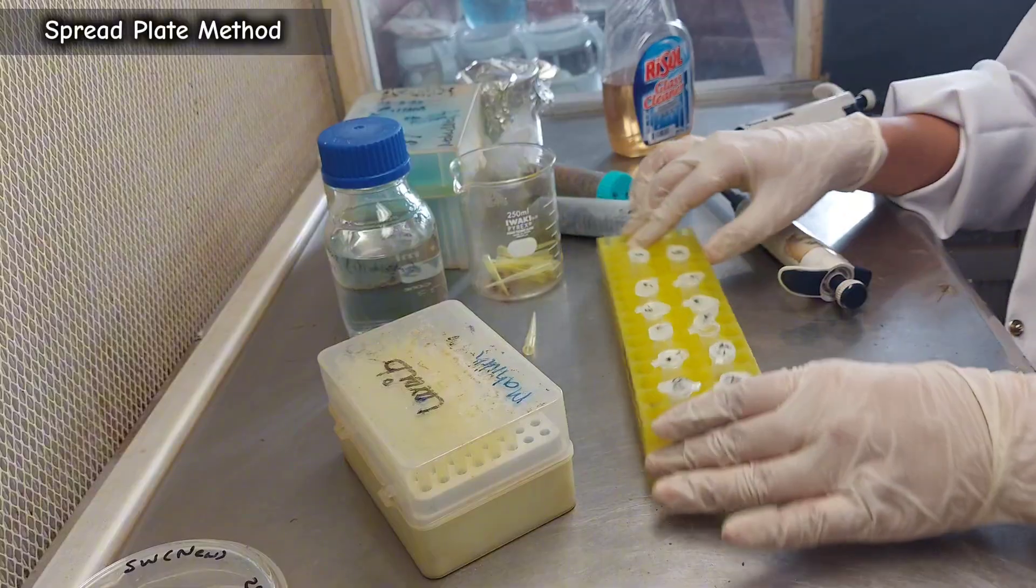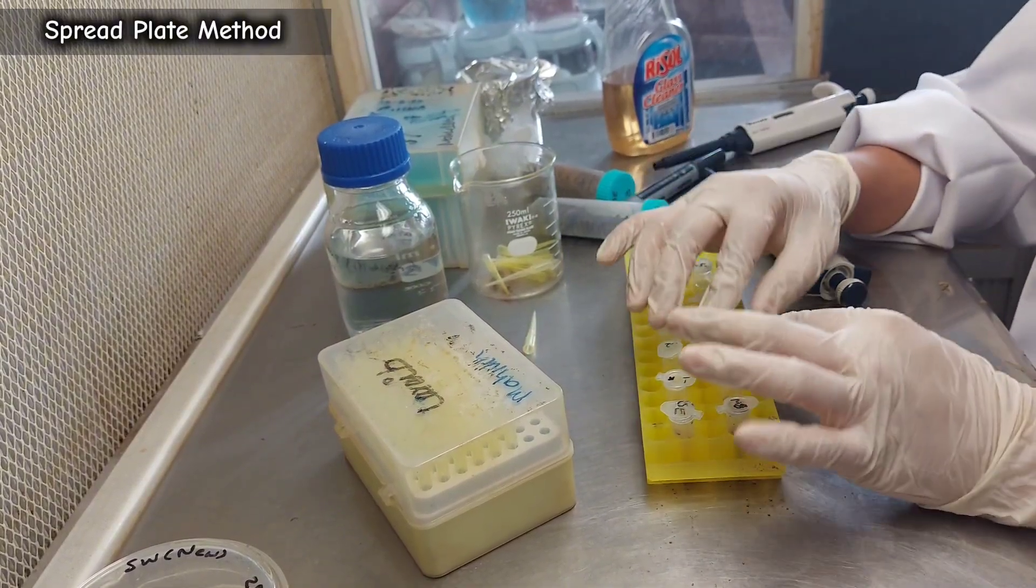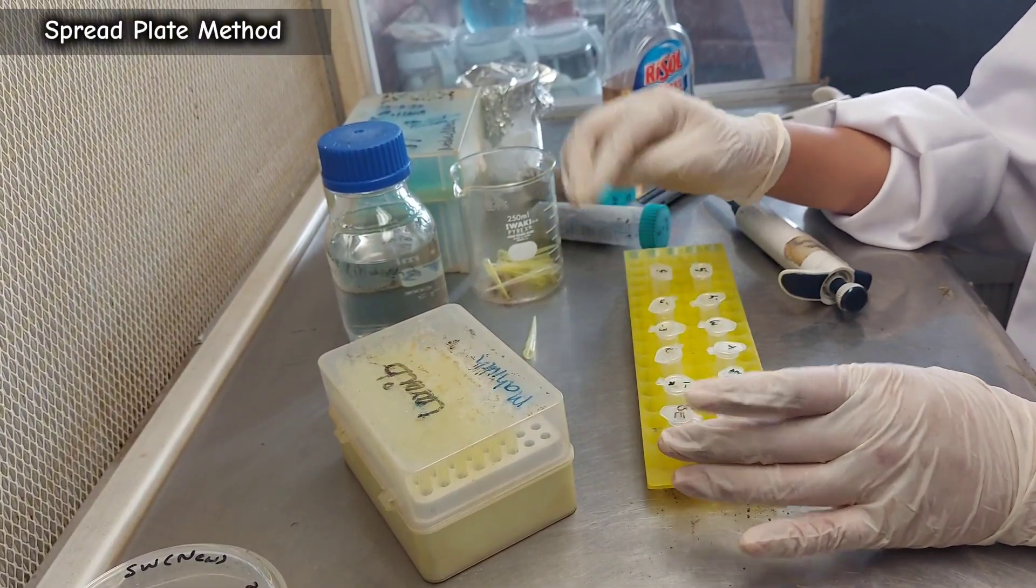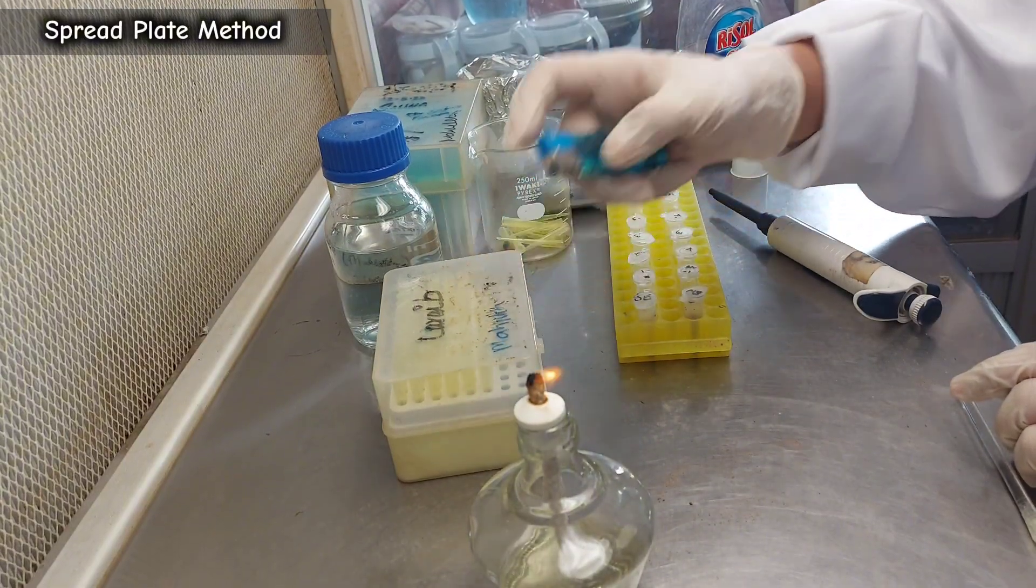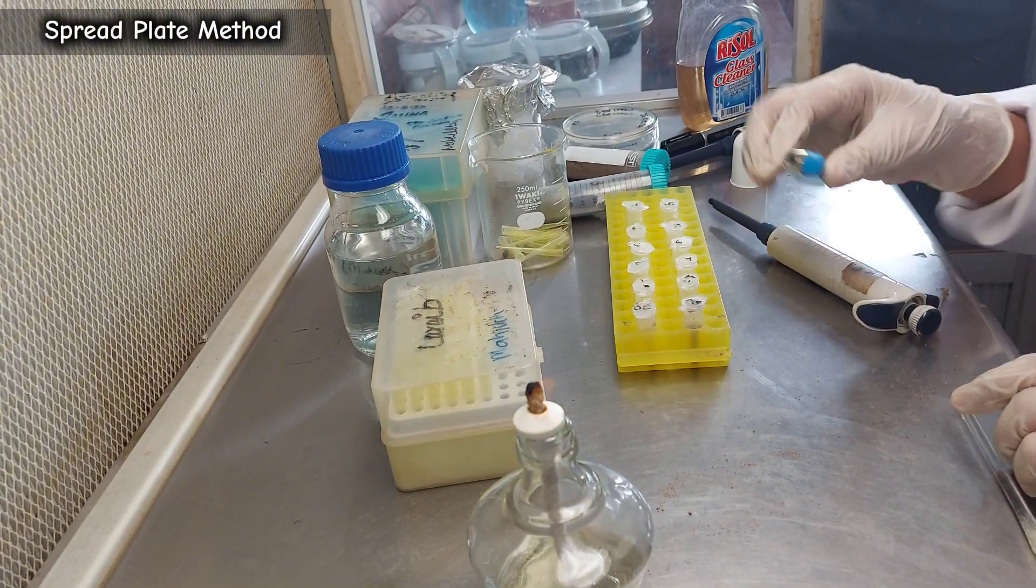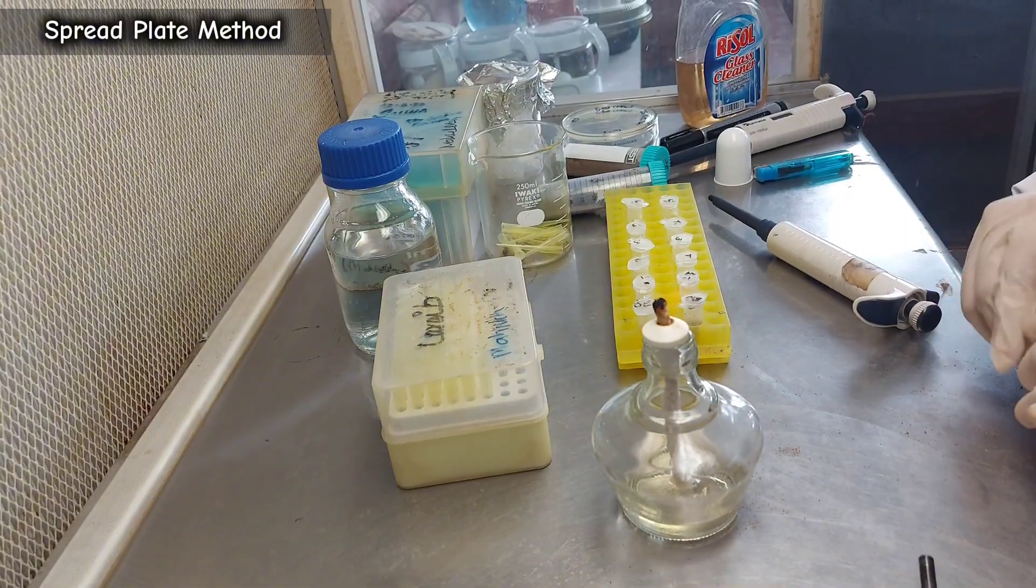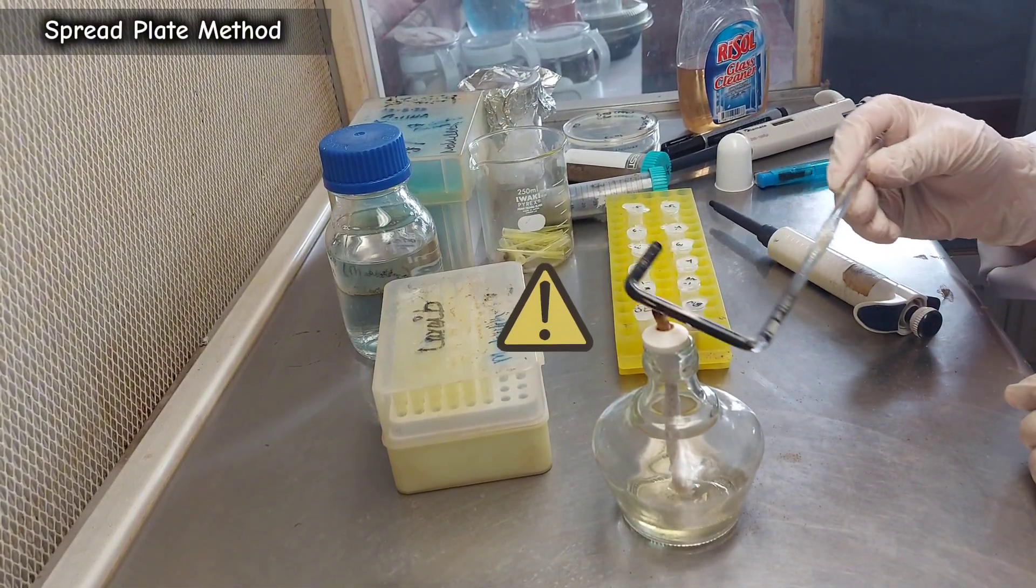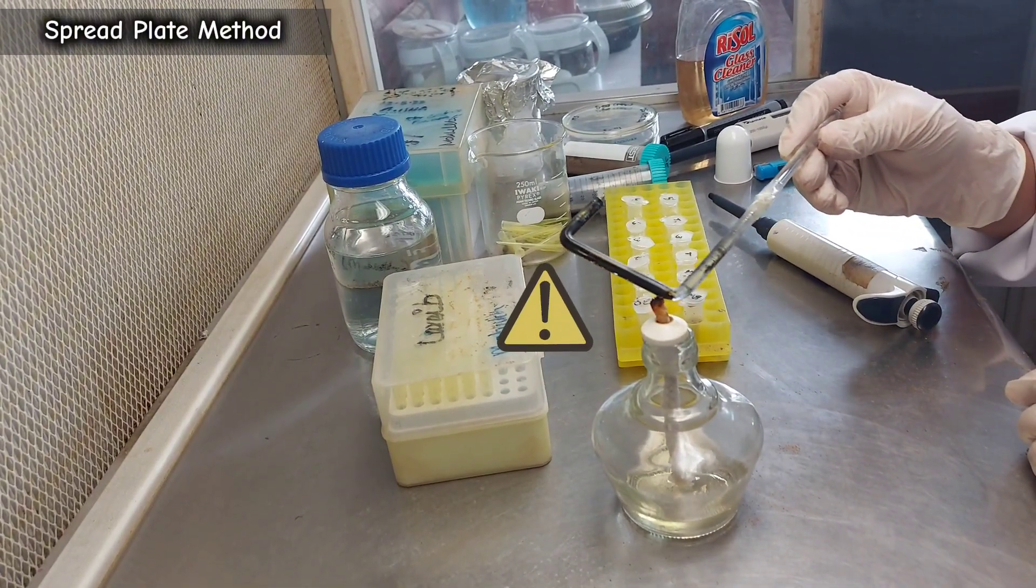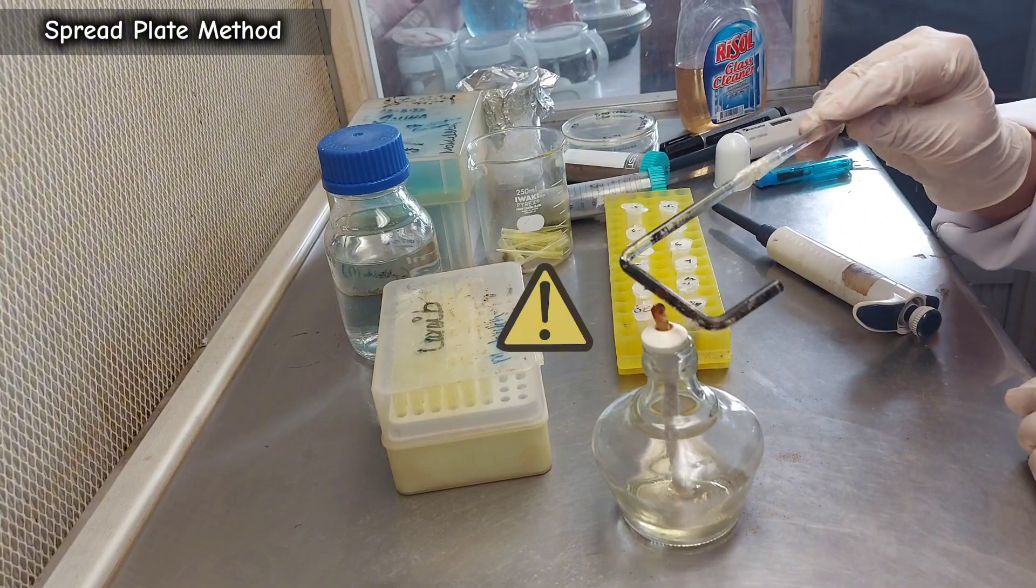Once the dilutions are prepared, we will proceed with the spread plating. Sterilize your glass spreader by gently warming it on the spirit lamp, then spraying it with ethanol. Always turn off the spirit lamp before spraying ethanol.